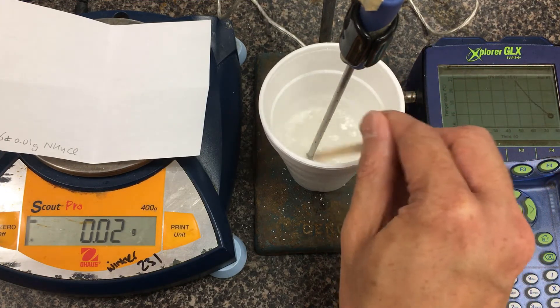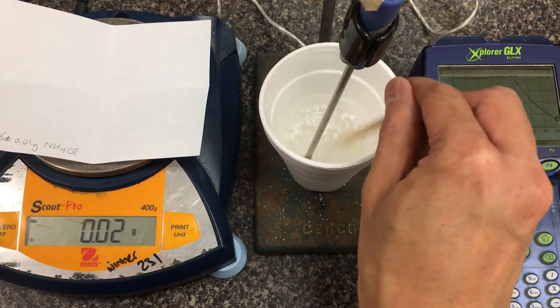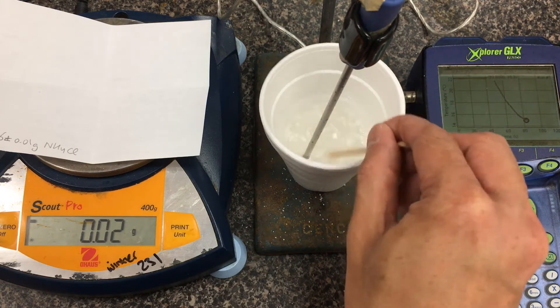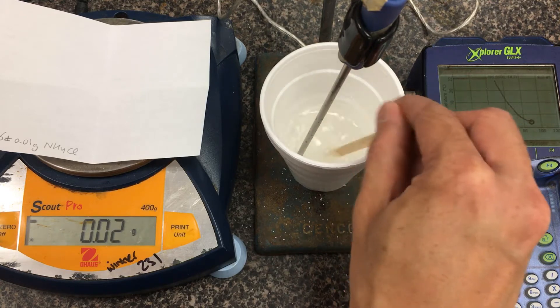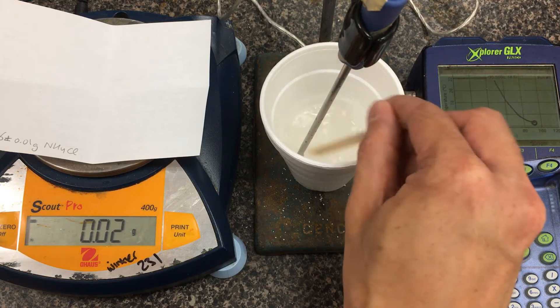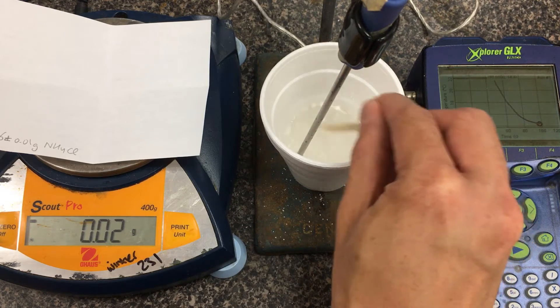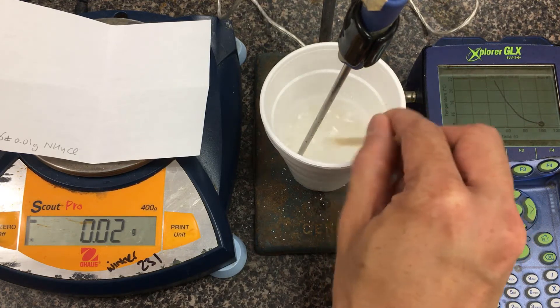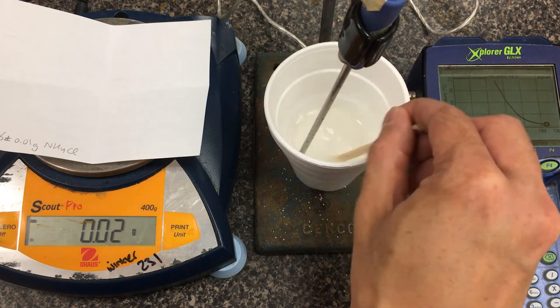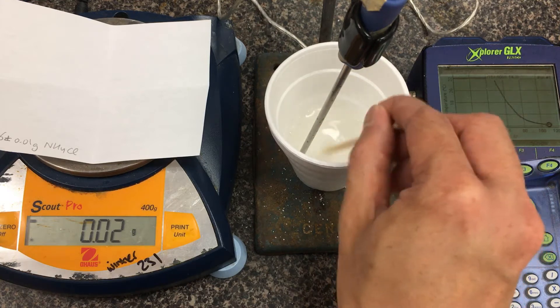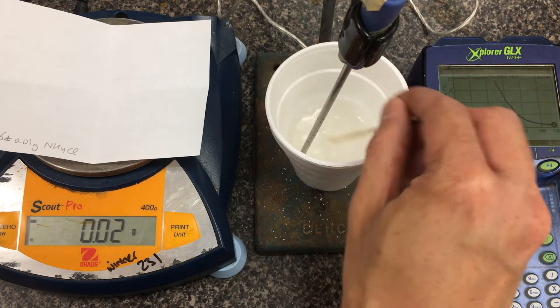You'll notice that the GLX probe is sensing a decrease in temperature. It's plotting our temperature in real time. Later on, we can export the graph. We see that the temperature actually cooled down, so this has been an endothermic reaction. Based on the graph, we're looking at about 14 degrees. I'm going to let this run for a little longer to get a sense of the linear trend as it tries to equilibrate back to room temperature, so we can do some extrapolating later.